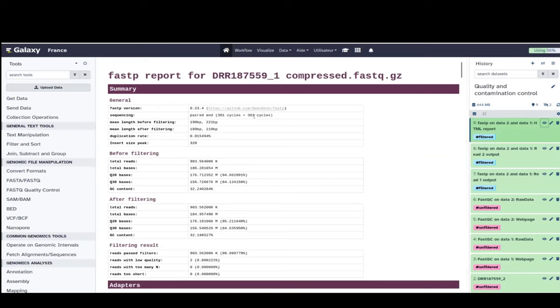With these results, we can say that the data looks okay. The number of reads in the first dataset is not optimal, but we can assemble the dataset. Today we are just checking the quality and filtering the results. We will not assemble today — if you need to do that, try another tutorial for genome assembly.